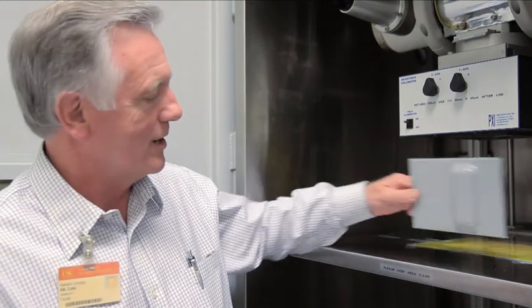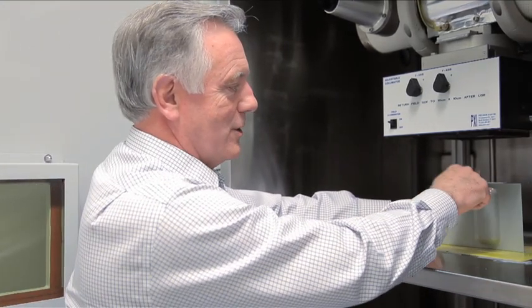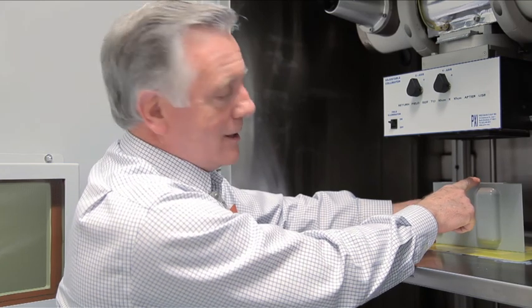For example, if you were going to put something rather large in here and the exposure surface is higher up, the dose rate would be much higher and therefore the dose on it would be incorrect. The dose is calibrated to this particular point right now.